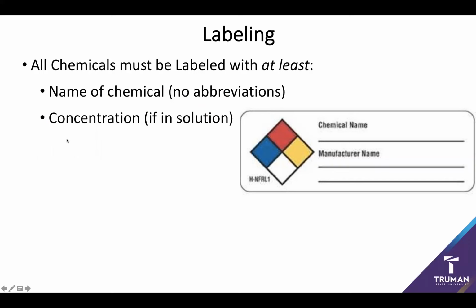So there was a group of students working in a lab preparing copper plates for surface chemistry work. One of the researchers was cleaning off their slides with 2-propanol. So, good old friend isopropanol, put it into the properly labeled container for the 2-propanol waste. And well, that's when things went a little bit wrong, because it turns out that somebody had used that bottle to store the nitric acid from the etching for the copper.